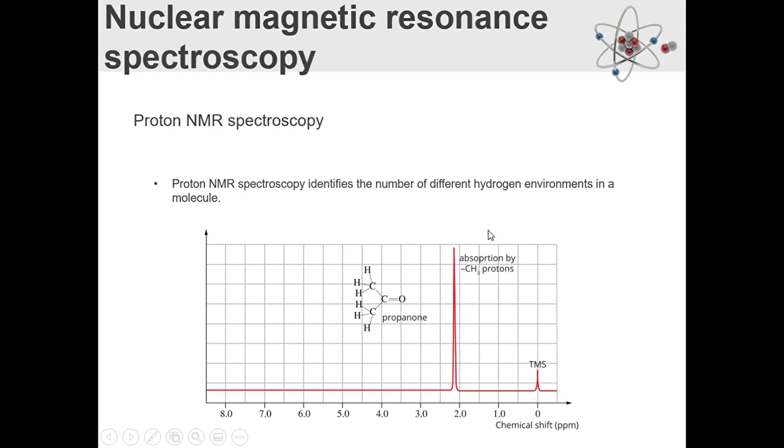So this is this one peak, and it's shown by the absorption. Wow, they really couldn't spell absorption in the textbook. But this is the peak of energy put out by each one of those hydrogens. And it's slightly past 2. It doesn't super matter what the number is here.